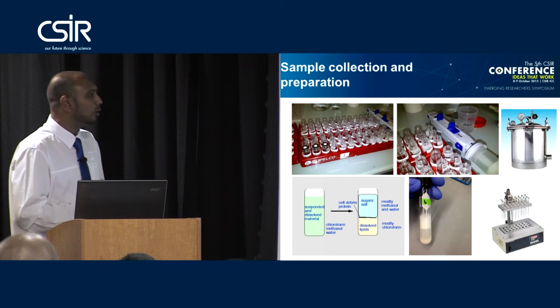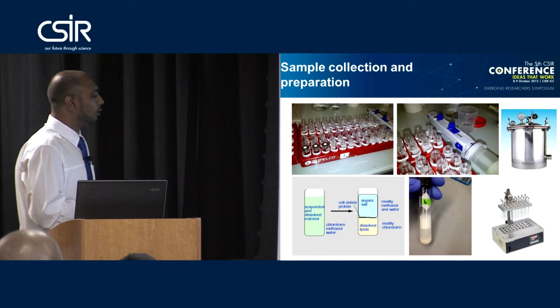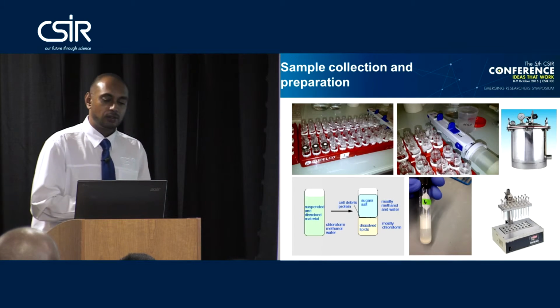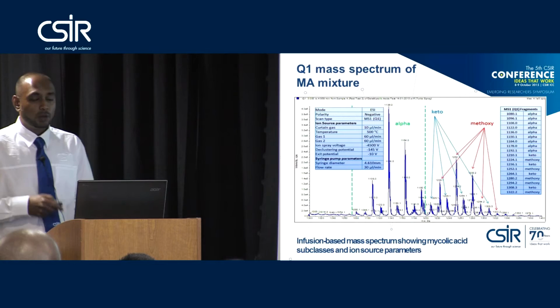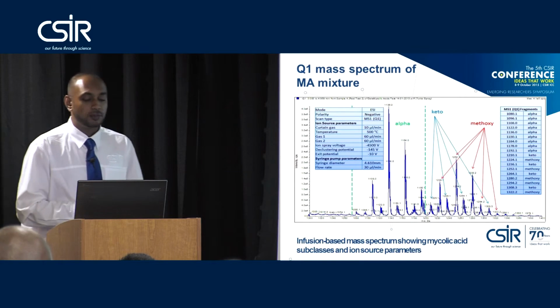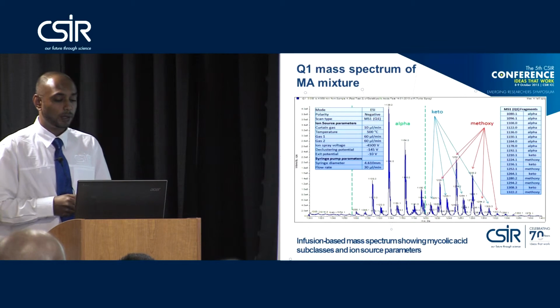There is also a middle layer which is very important, which contains a lot of the protein debris. So the chloroform extract was transferred to a separate tube, dried under nitrogen, reconstituted for analysis on the mass spectrometer. Now, the study we performed with the biochemistry department includes a lot of mass spectrometry, liquid chromatography and mass spectrometry on the triple quadrupole mass spectrometer.